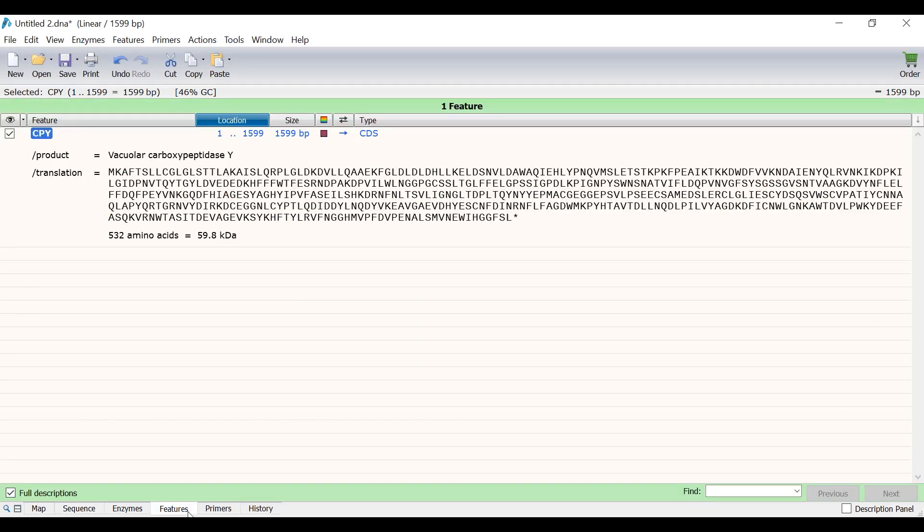By switching to the Features tab, you will see that the CPY feature is listed, alongside additional information such as the product and the amino acid sequence.